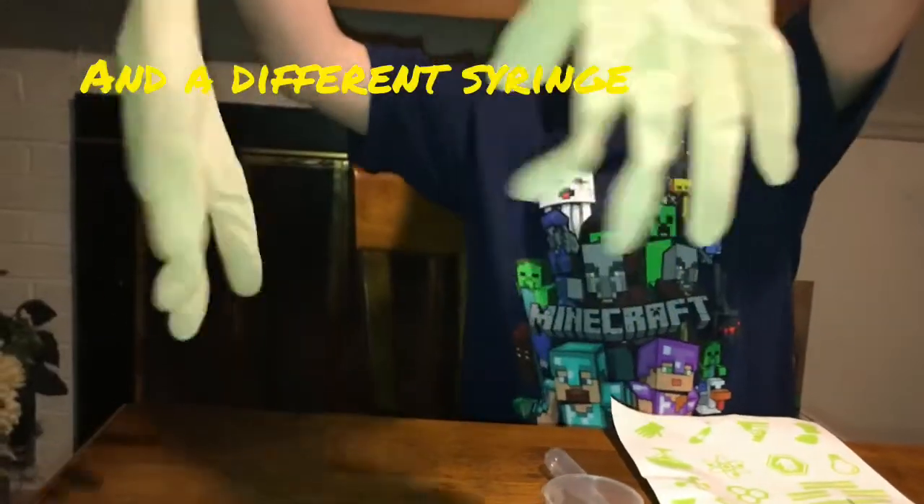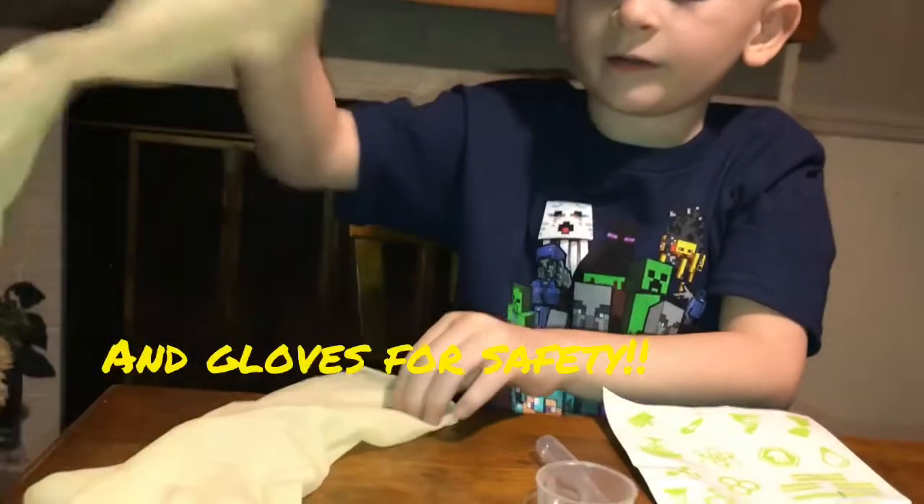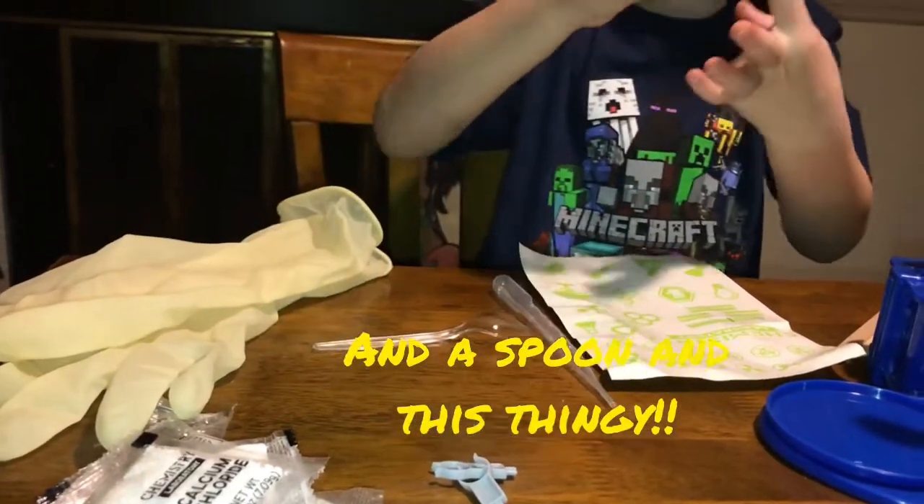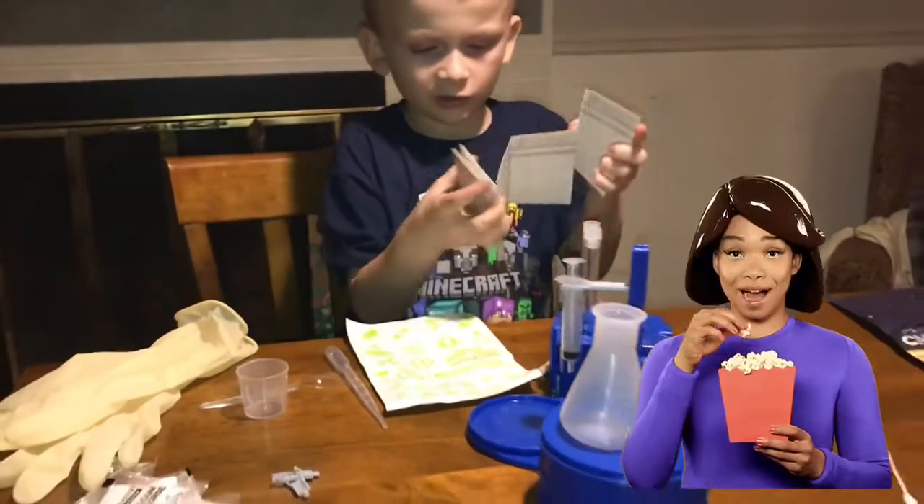It comes with stickers to decorate, and it comes with a syringe — this is a different syringe. It comes with gloves. You know why? Because safety! And it comes with a spoon and this full thing.